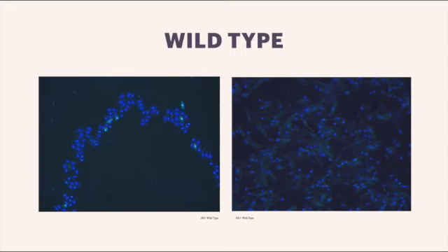In regards to the GFP production, in the HU minus, of course, you're not going to see a lot of GFP production because there's no cell repair necessarily happening yet. While on the HU plus side, you do see quite a bit of RAD22 GFP production. This, of course, once again, is not a mutant, so this is a pretty standard observation. This is what most wild type will look like.